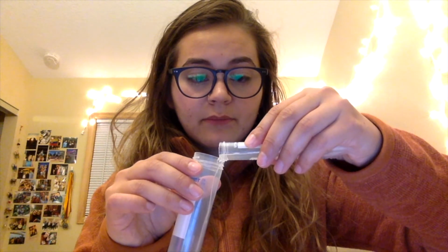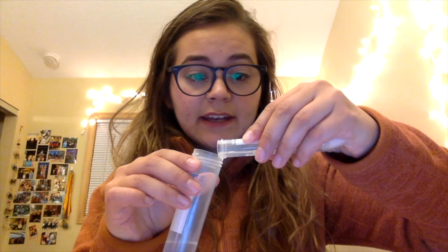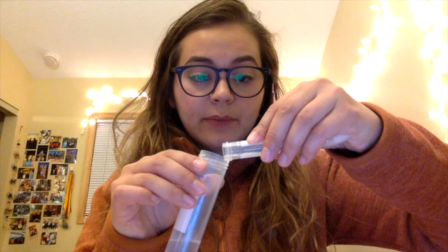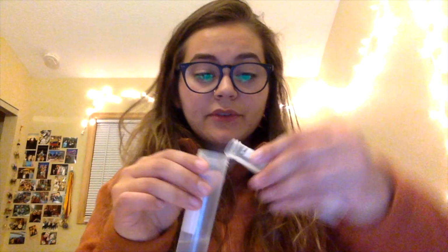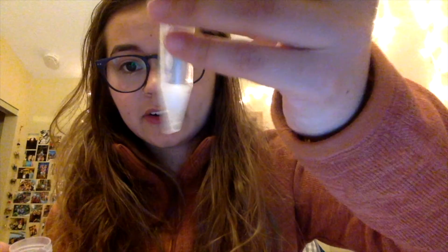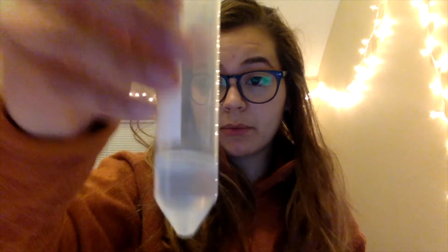So pour it slowly, and if you start seeing some bubbles, just stop before you drop the bubbles. So, okay, I'm getting some bubbles right there. So you can see everything that is left right here is mostly just bubbles. And in this tube, I have a solution with no bubbles. All right, so I'm gonna cap my tube again.